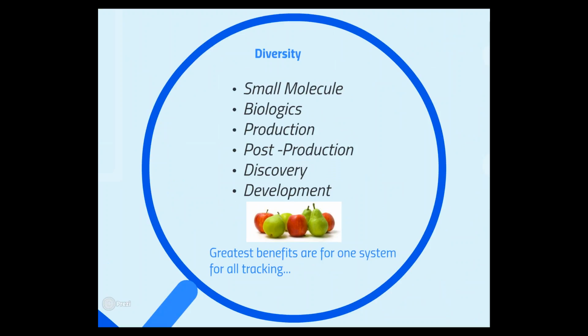It could be requests for development of targets into an assay, dosing of an animal, or sampling and the analysis of samples. So it's got to be very able to cope with these different environments for requesting services and assays. It needs to cope with both production work but also post-production work as well.